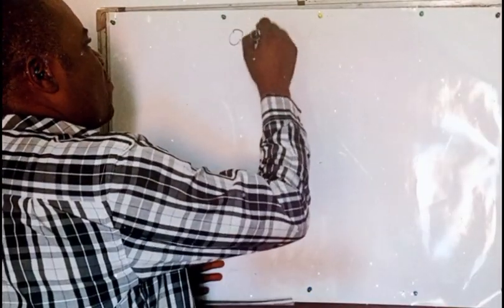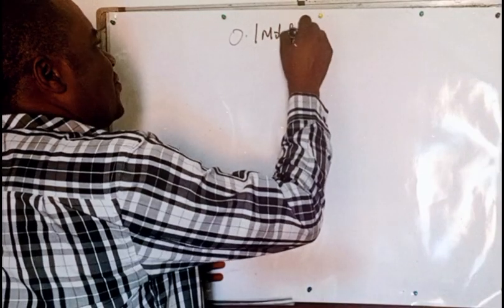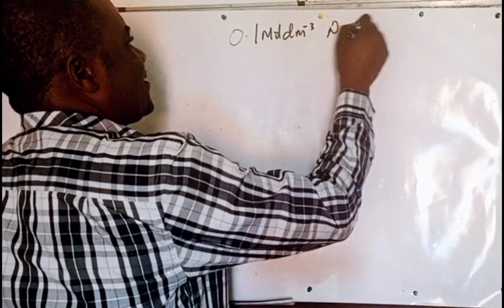We are going to continue from where we stopped, the preparation of standard solutions. And today we are going to discuss how we can prepare 0.1 mole per dm³ of sodium carbonate. That is a base. It's different from preparing an acid. Here, we do not consider the relative density of the substance. Come with me. Now, we are expected to calculate 0.1 mole per dm³ of sodium carbonate.